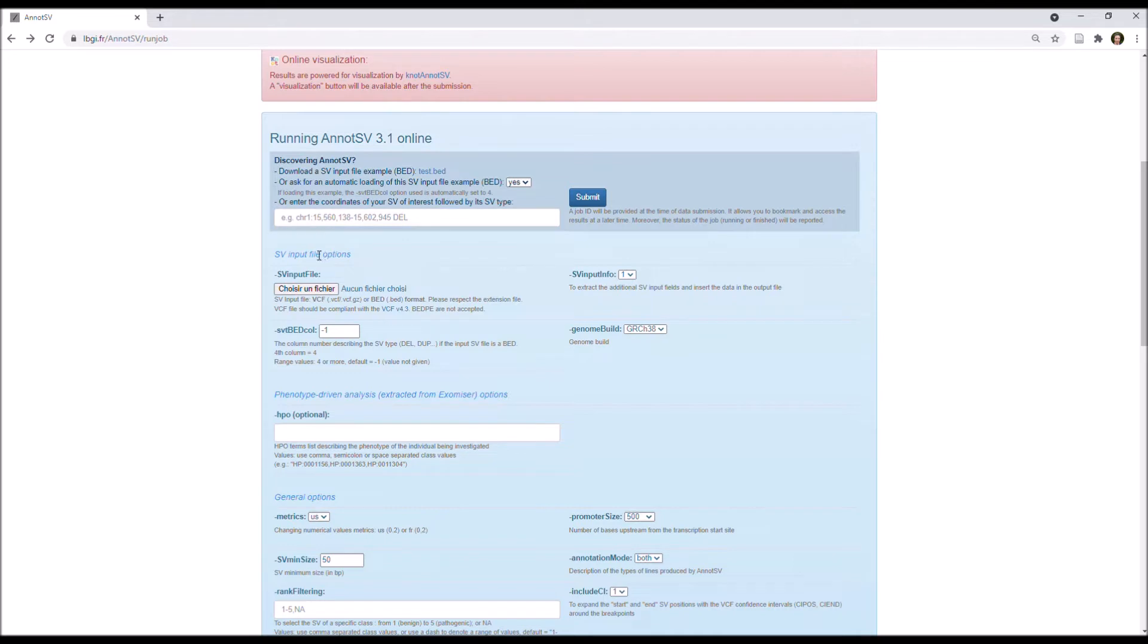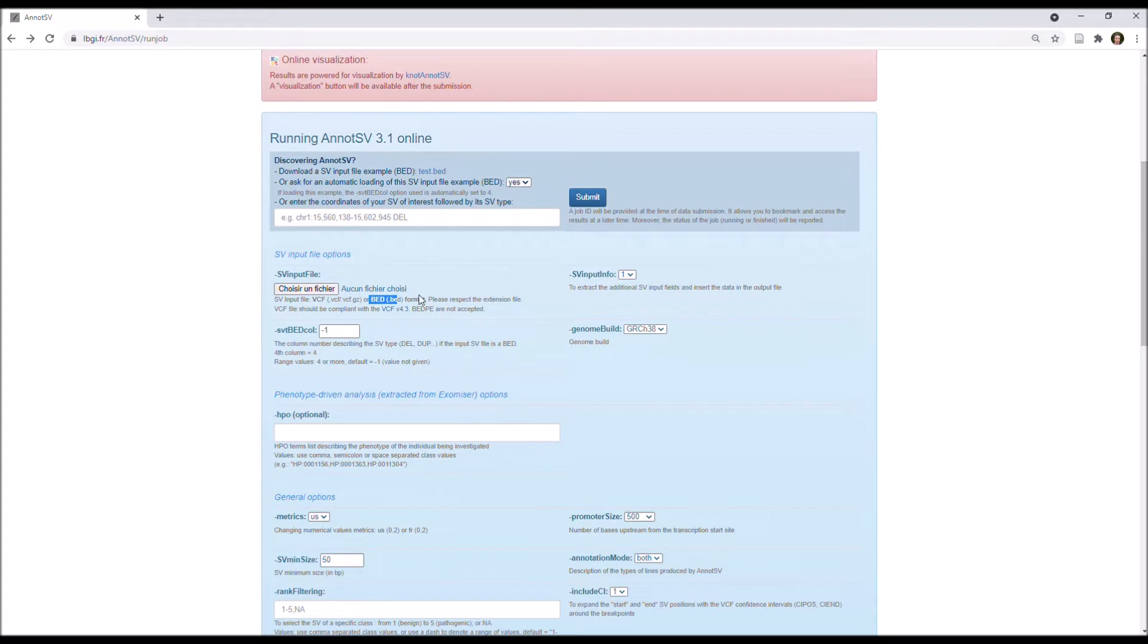And finally, you can also choose to submit a classical VCF or bed file, and so you can upload your file there. For the demo, I'm going to keep the SV input file example.